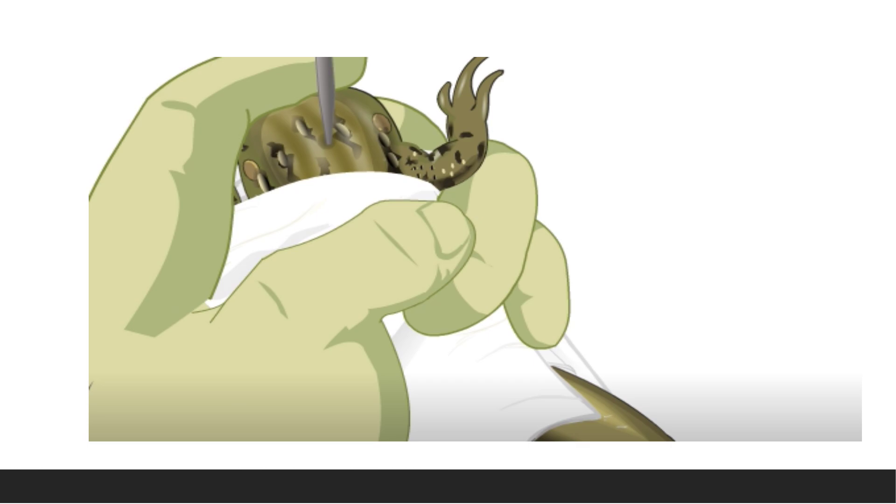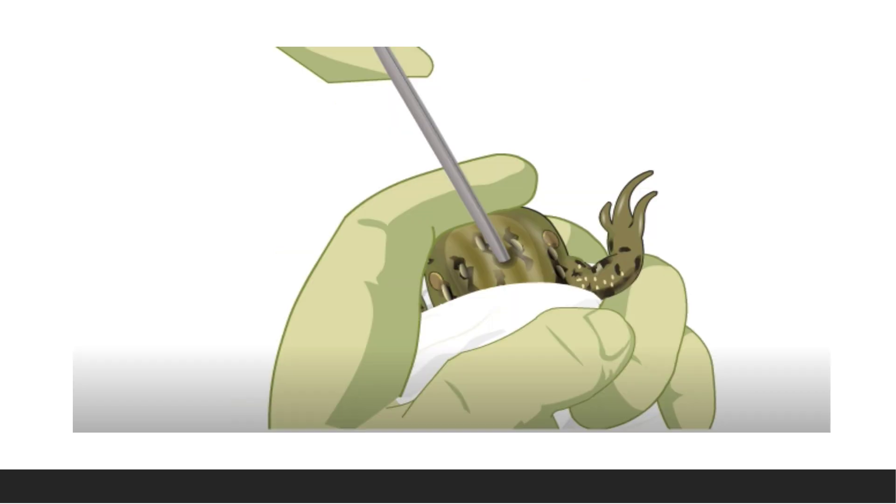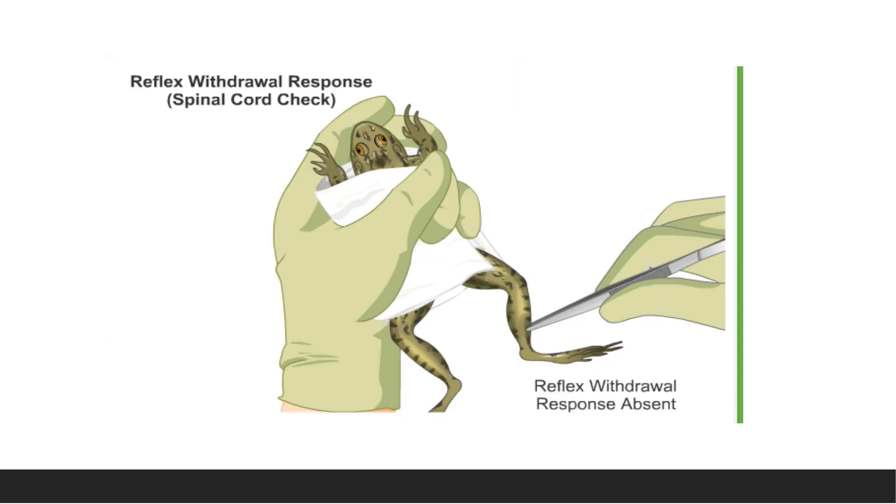Through this depression, insert the pithing needle and first push it anteriorly into the cranial cavity and destroy the brain by rotating the needle. Then introduce the needle into the vertebral canal and rotate it to destroy the spinal cord. To confirm proper pithing: if the corneal reflex is absent, the brain stem is properly pithed; if the withdrawal reflex is absent, the spinal cord is properly destroyed.